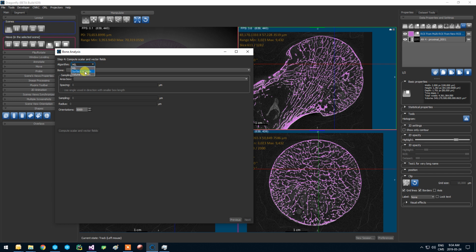We have as well this surface normal algorithm, which is also an anisotropy computation that will output a dataset and a vector field, but the technique is different. It is based on the faces, and so if we provide a ROI, it will compute the contour mesh as the first step in the area where we want to compute the anisotropy. Then for each grid point, the faces around it will be taken, and the orientation of the faces will be accounted for, and we'll get an anisotropy based on the orientation of these faces.